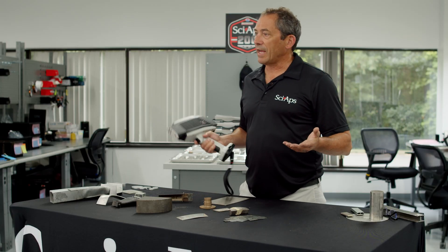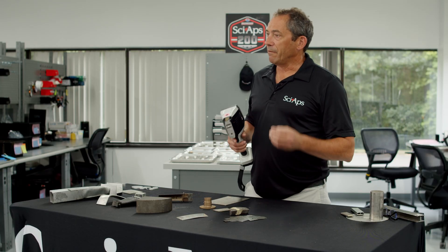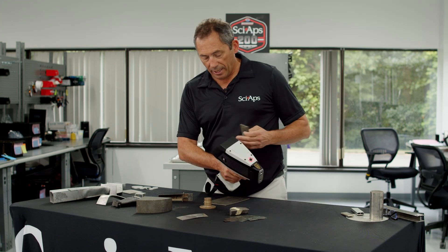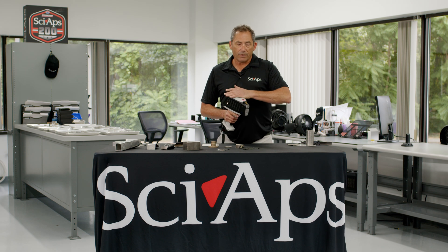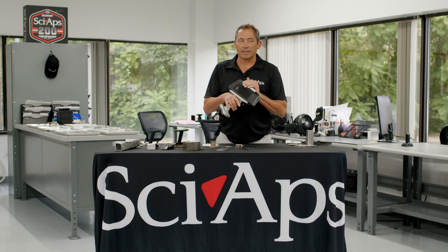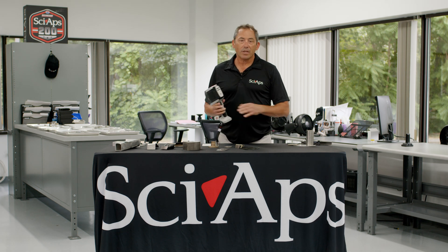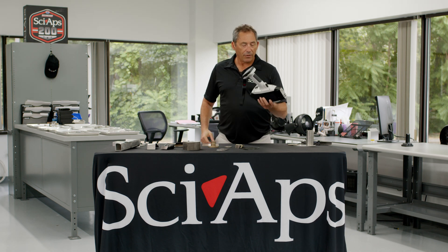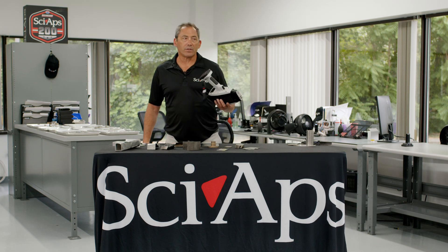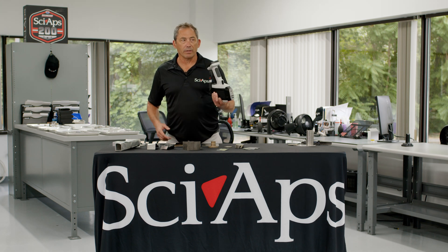So that's really how the device works. It's fast, it's easy, does all your bases, it's repeatable, very safe. You've got a lot of nice features on here like the internal camera. It's cloud-based, so if you want to just download everything to the cloud you can — you don't have to be printing out Excel spreadsheets. It's a great system and it's priced really competitively. I think it's a great tool for just fast alloy sorting, whether you're a smaller recycler or you're a fab shop and you need to know what your metal is.